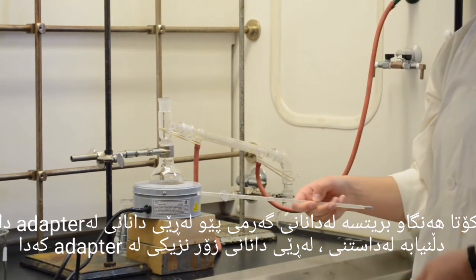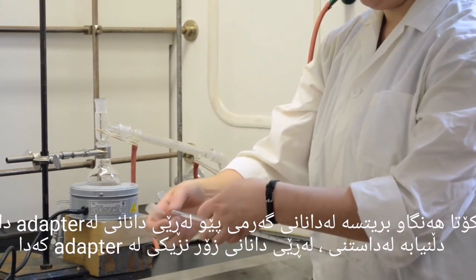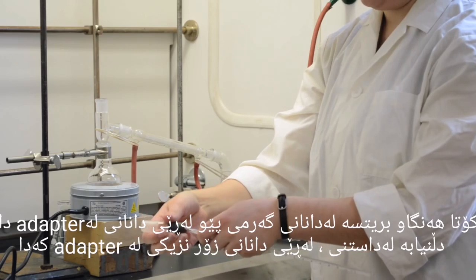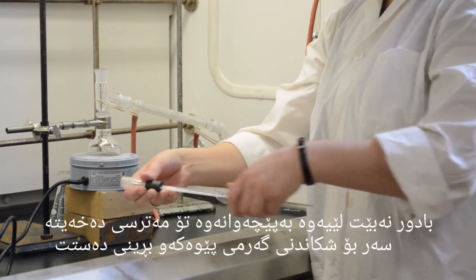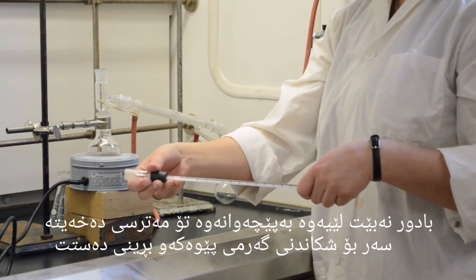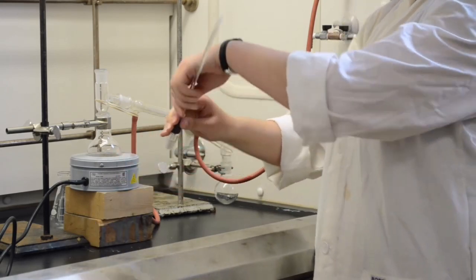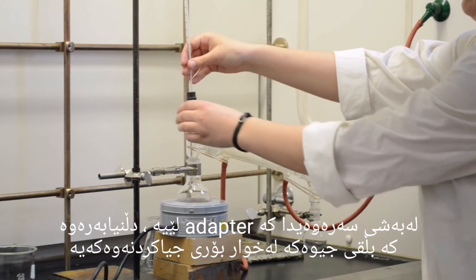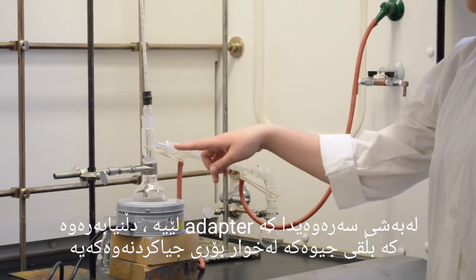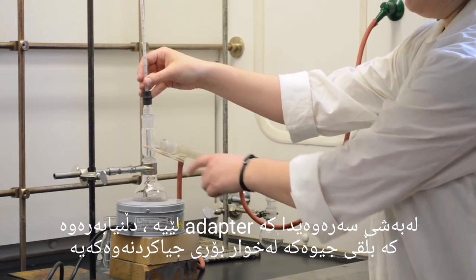The final step is to add a thermometer using a thermometer adapter. When putting the thermometer into the adapter, be sure to insert it by holding very close to the adapter and using a gentle rotating motion. Don't hold from far away or else you risk breaking the thermometer and cutting your hand. The thermometer is placed on top of the condenser adapter, with the mercury bulb sitting just below the joint in the distilling head.